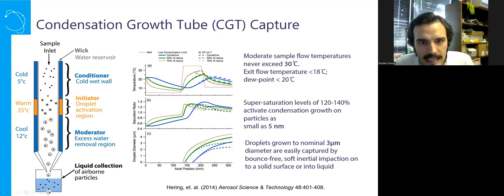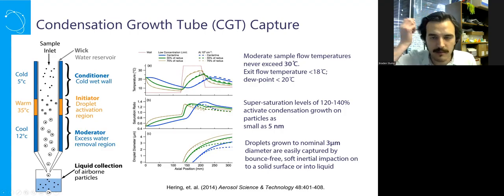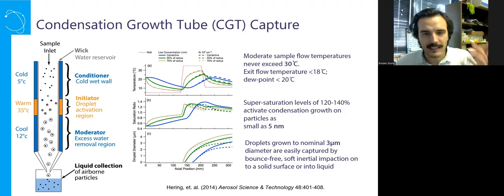The most that it's seeing is 30 degrees Celsius, but the residence flow through this section is well under a second, 0.3 or 0.03 seconds. You can follow up with me for that exact information. I do not have it on hand currently.